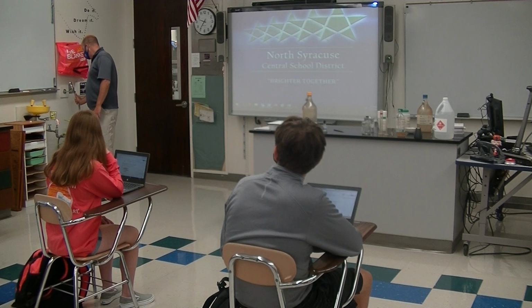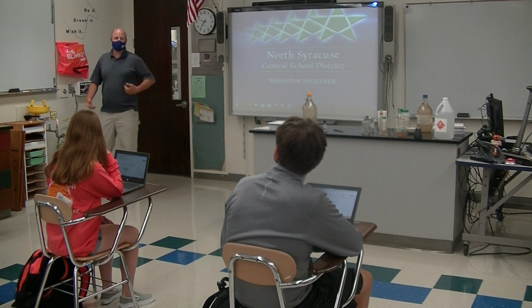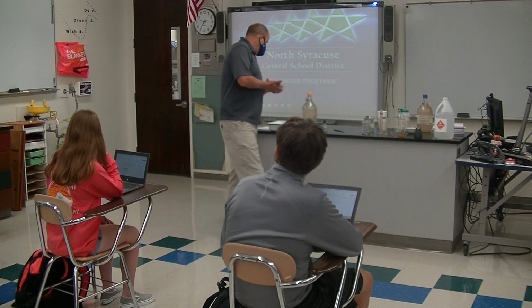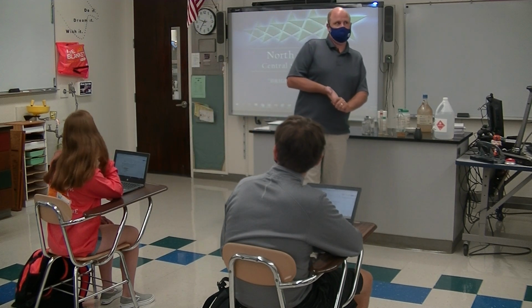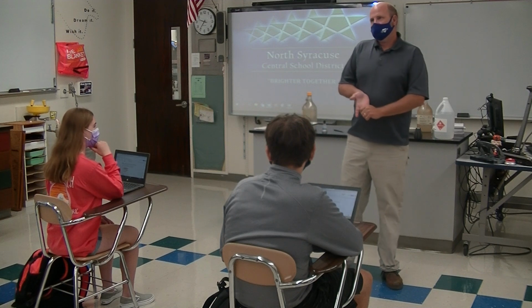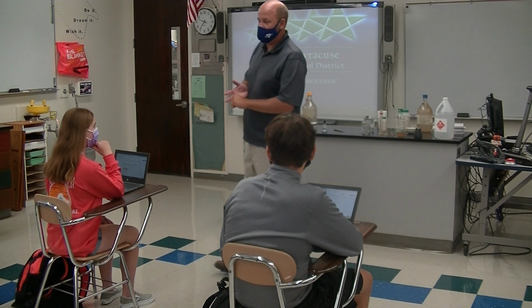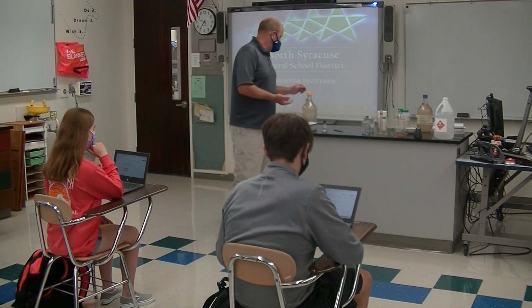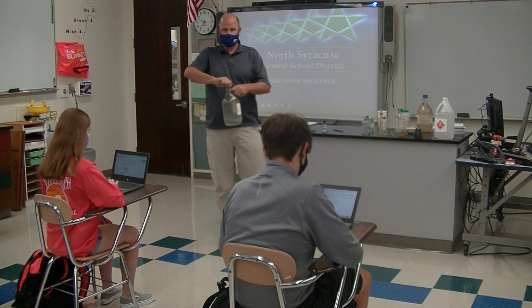So if you were to get some acid on the front or back of you, you have to remove the clothing and clean with water, or flush with water. Alright, this actually happened 15 years ago-ish, with a teacher, not even a student. A teacher was in the prep room, and they were using a bottle like this of acetic acid.